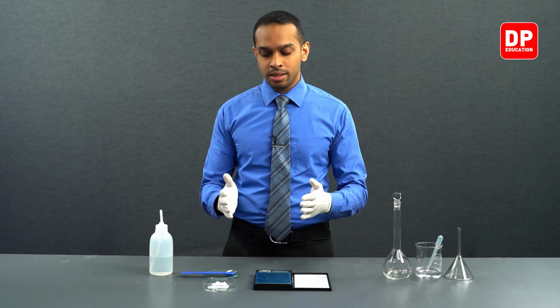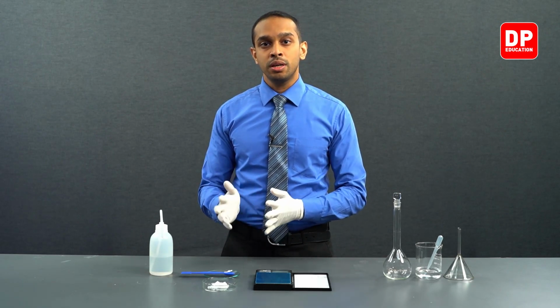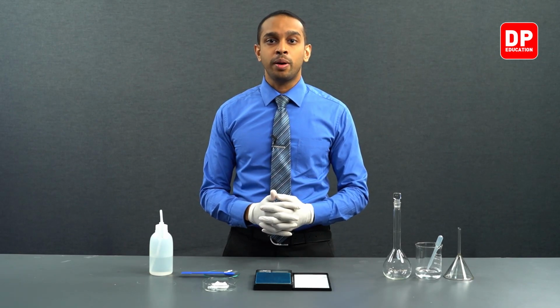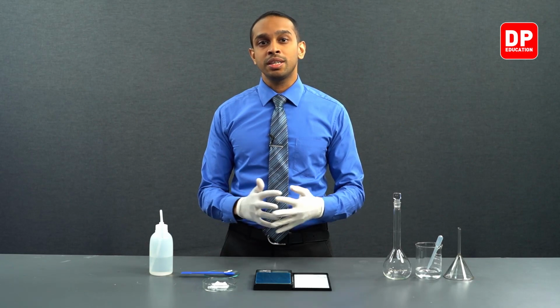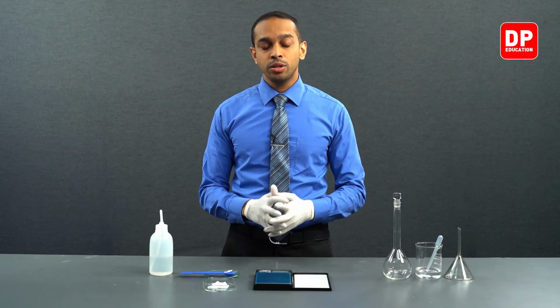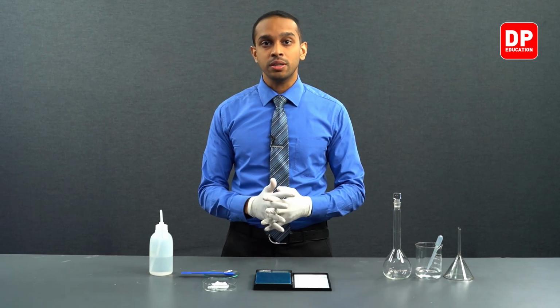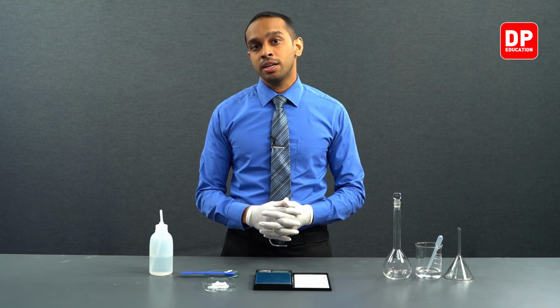As well, if you leave a potassium permanganate solution to stand for a while after you prepare it, it has the ability of getting decomposed if it is exposed to sunlight. So, we do not want a standard solution formed with such a substance.